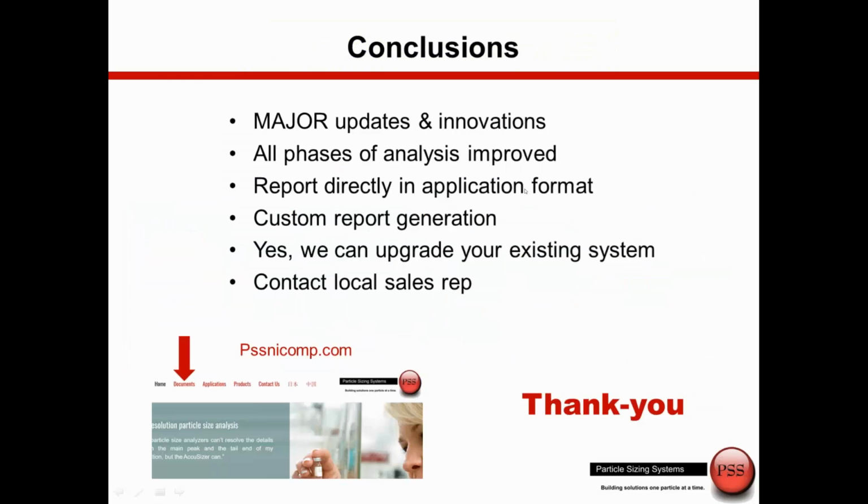So that's the information I wanted to show today, to just give you a feel for the major updates and innovations in the new software. We've improved all phases of how to prepare the system, how to make the measurement, how to report, and how to deal with automation. Database tools for managing the data. Custom reporting so that you can have the data in the format that's most important to you. So hopefully anyone who's used our old software would see the major improvements with this.